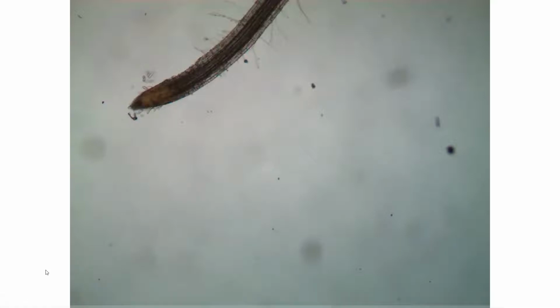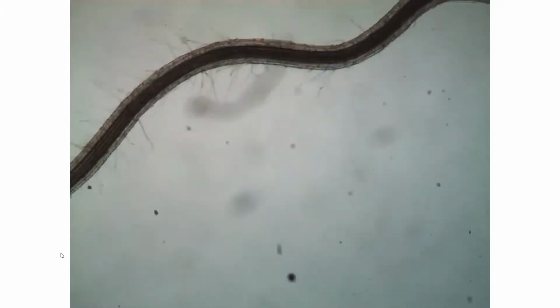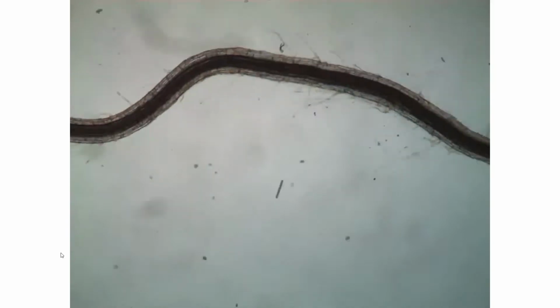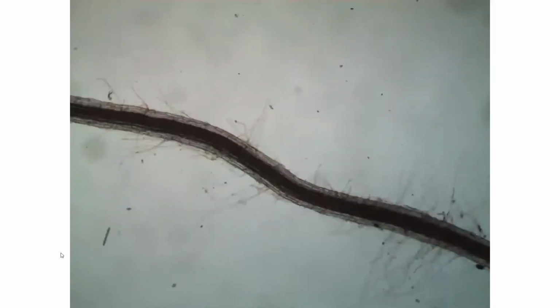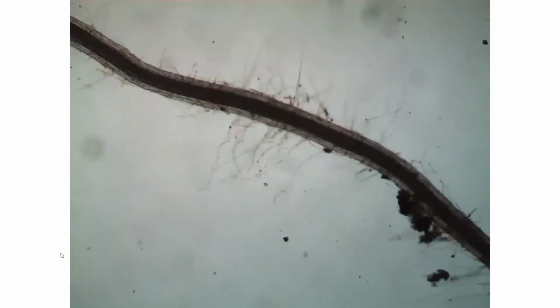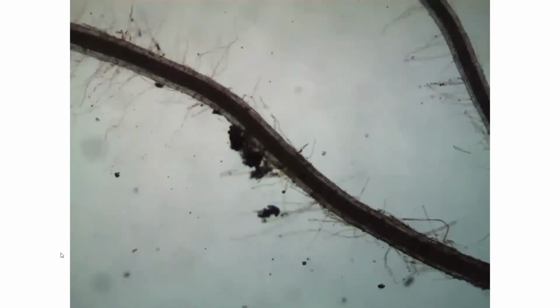So this little video is just going to show a movement up the root here, showing the region of cell differentiation, all the root hairs that are produced. So lots of root hairs. So this area is quite extensive. And in a root that's in the soil, these root hairs probably wouldn't be so visible and extensive.